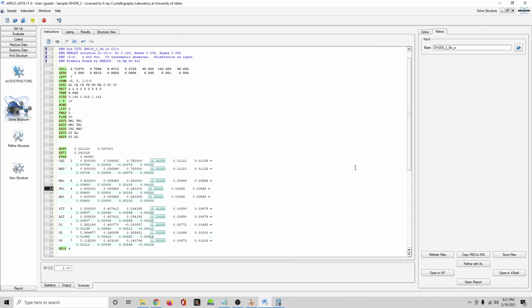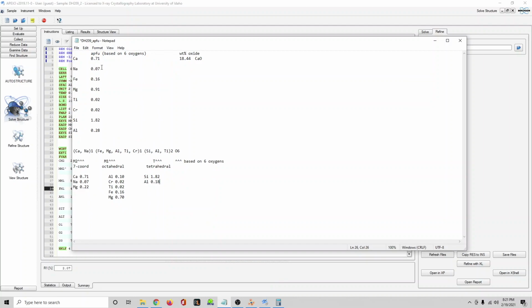All right. So I took a little bit of a break there to figure out some stuff on splitting all the positions up. So what I did, on this little notepad document, is figure out a fair way of splitting up the ratios based on the microprobe data. Again, probably best to do the optimization method with the program Occupy, but I think this is a fair one.